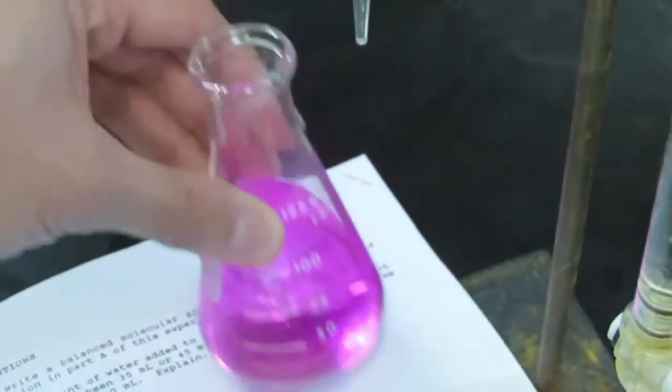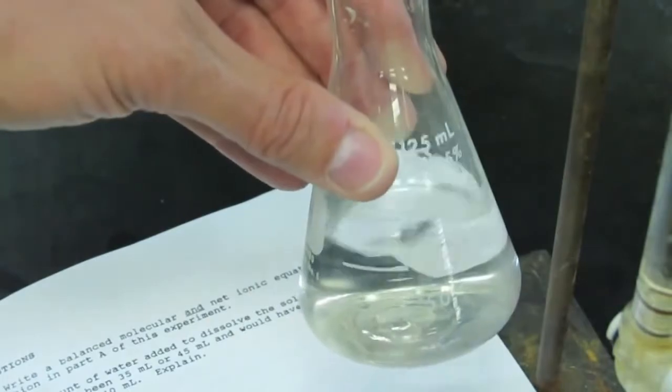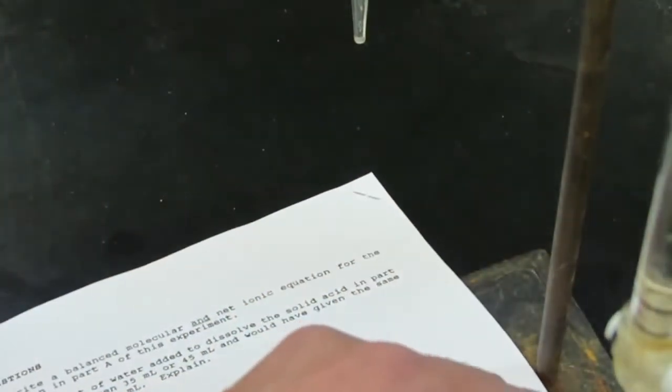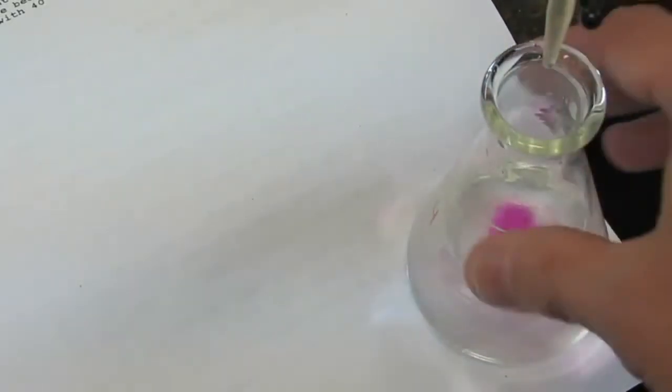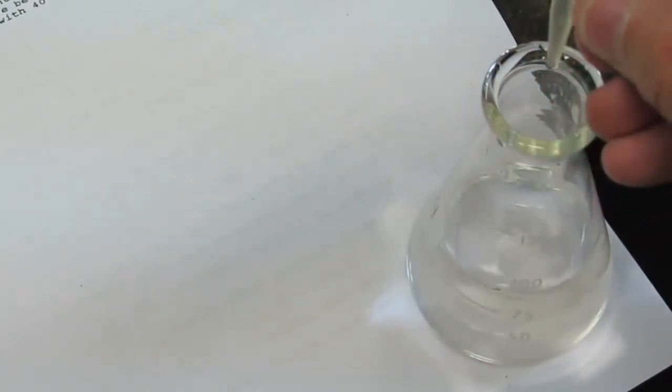Not too much. We'll swirl that, and there we go. The pink color's gone, so now it's acidic. And we'll continue to add the base. This time we'll do it a bit more slowly. Just a couple of drops there. Almost. A few more. Once again, we want to continue doing this until we get that pink color to stay. And once again, the objective is to get it to the perfect drop.